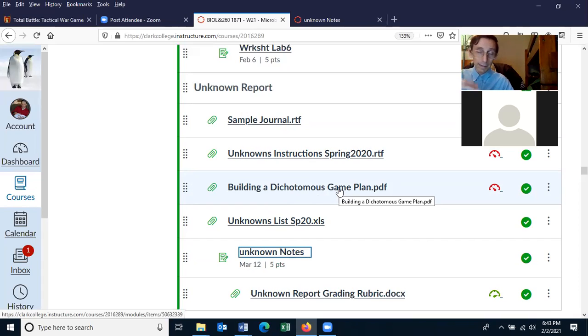the possibilities are and say that, oh, I don't know, you got the gram stain, and so it's gram positive. And then you do the lactose fermentation test, and it is acid and gas, okay?